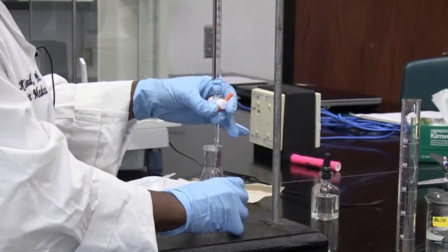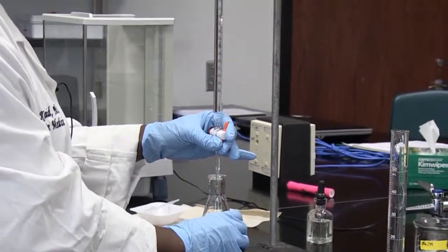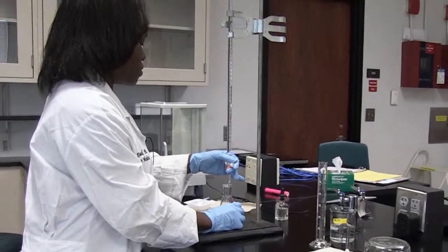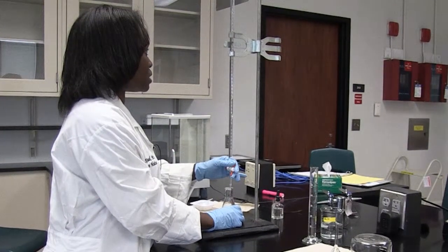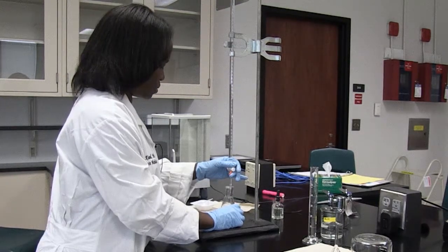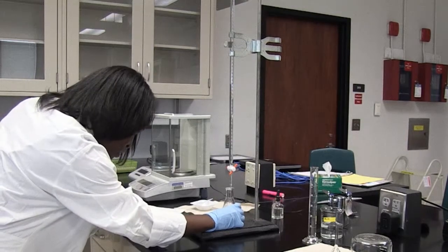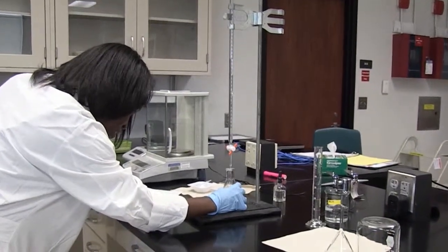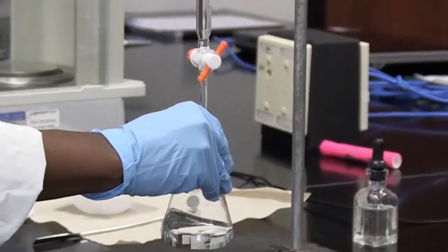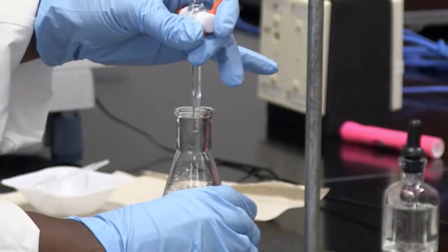This is what you would do the first time around. You're going to do this three times — this is called your trial run — to give you an idea of how much volume you need to add to your acid in order to end the reaction. Remember, the reaction ends when the solution turns from colorless to pink. I notice that my solution is starting to get pink, but the pink does not stay, which tells me I still haven't gotten to my end point yet. It's important to keep swirling the flask so the reactants can mix with each other.